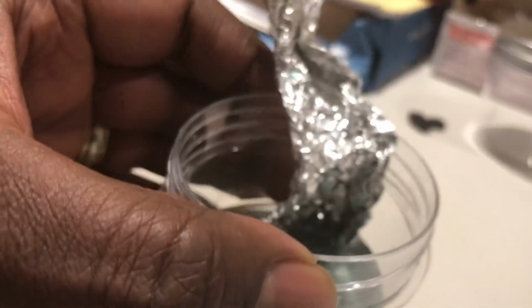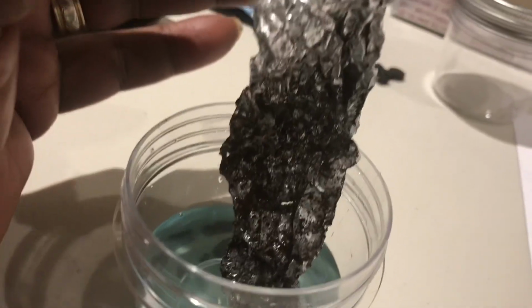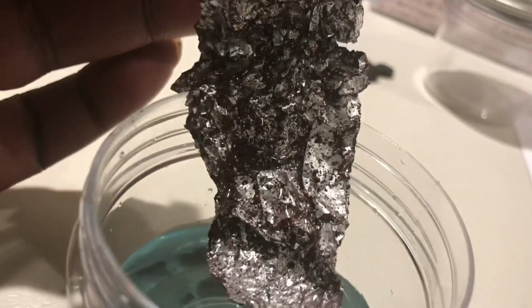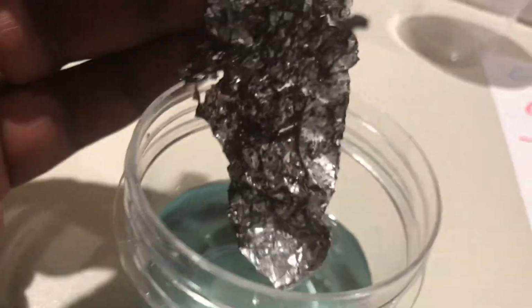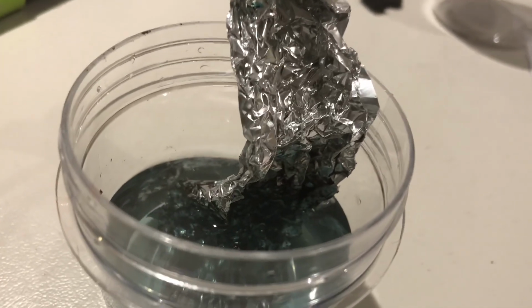Folks, that's actually copper. Now let me take out the aluminum foil so you can get a look at it. You see what it looks like? That darker material on it now. It's not shiny as much anymore. That dark material on it is copper formation. So I'm going to take it out in a second so you can see the residue inside the container.